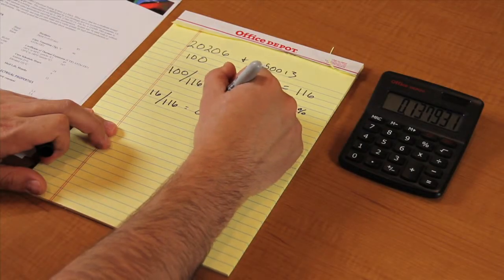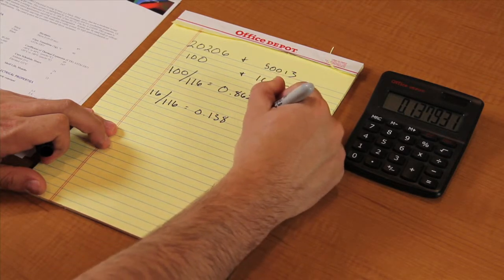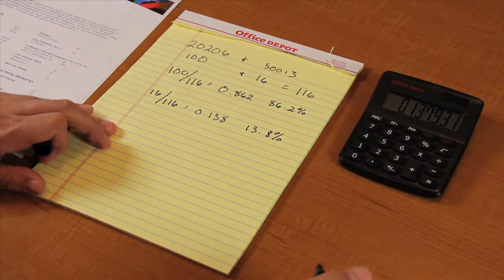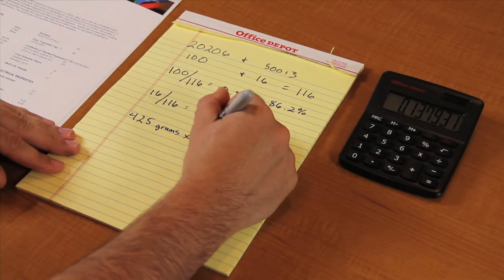The 50013 is 16 out of 116 units. That gives us a percentage of 13.8%. Now let's calculate the amount of material to add.